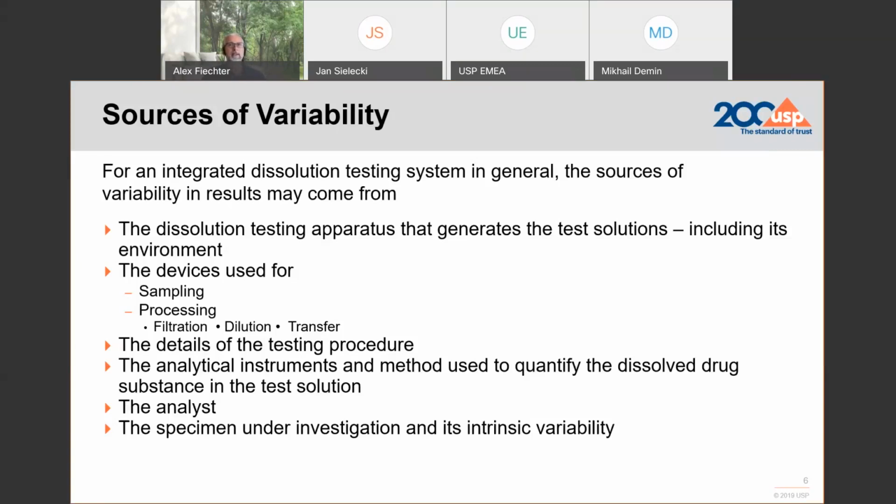The analytical instruments that are used on top of the dissolution tester obviously play a certain role. As I said before, we all have our daily moods and daily stresses and so forth. So ourselves as analysts have to be very careful that we, in a very reproducible way, do the testing on a common basis.